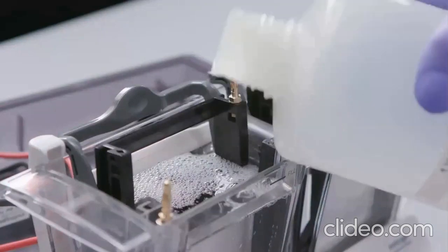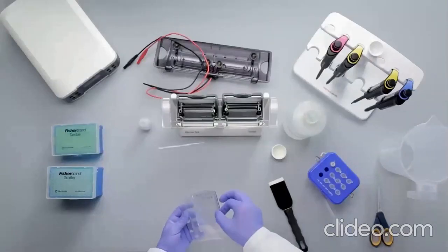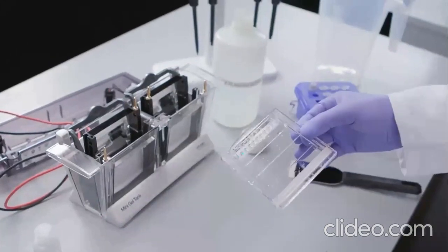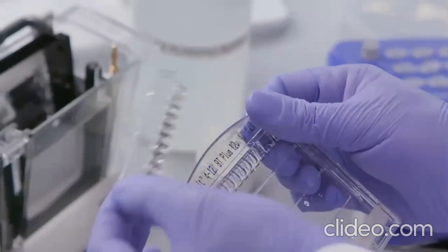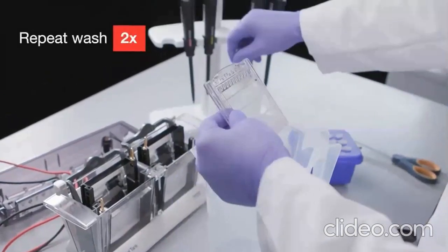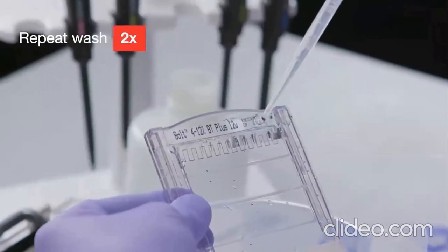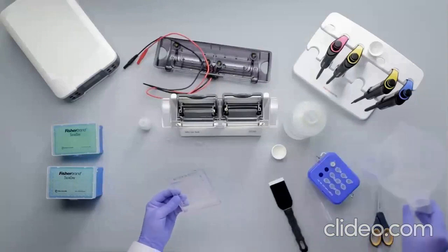Once the tank is set up, cut open a gel cassette pouch and remove the cassette from the pouch. Gently remove the comb either by sliding the comb up one side at a time or by using both thumbs to push both sides of the comb up simultaneously. Wash the cassette wells with running buffer and invert to remove any excess. Do this 2 more times. Make sure you remove the tape at the bottom of the cassette.